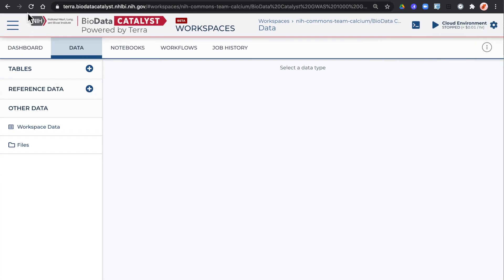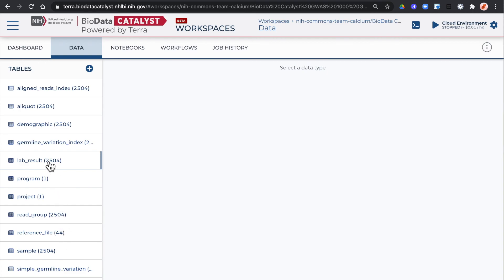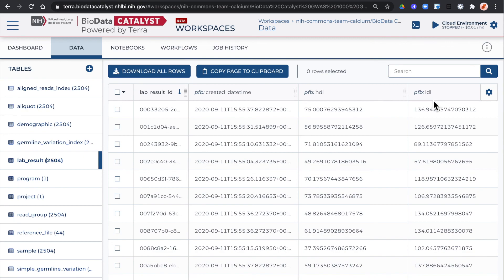If you refresh the page, you'll see a number of data tables. Each represents a different node in the Gen3 platform. Clicking on one you can see the data in that node. The lab results include high-density lipoproteins and low-density lipoproteins, for example.